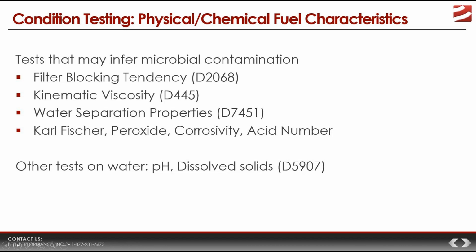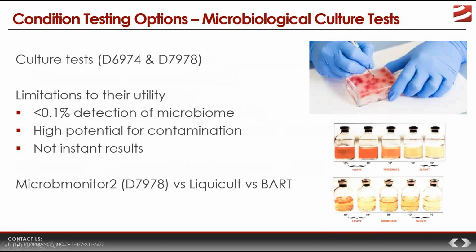But the last category of tests that we would undertake in a systematic condition testing program are the tests that are most specific to measuring or detecting microbial contamination itself. And those are the microbiological tests. Now we're getting into the good stuff here.